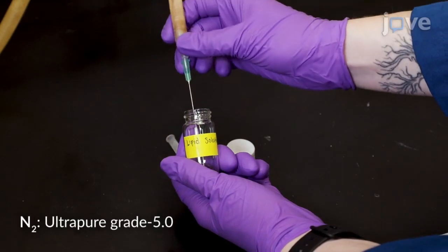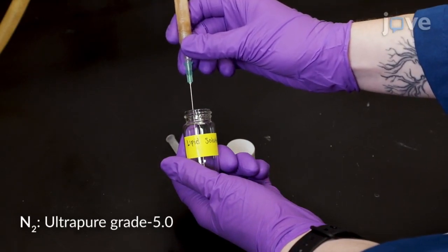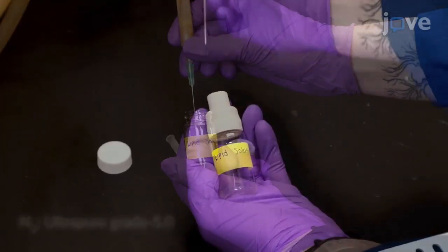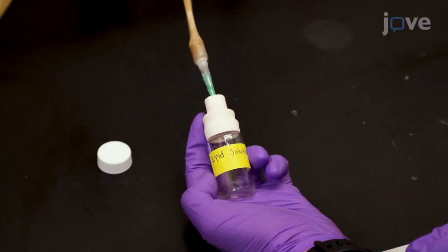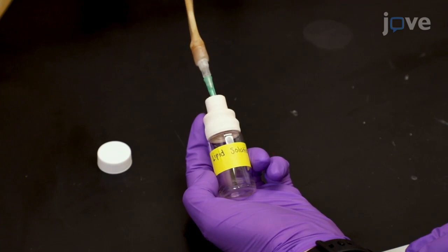Remove chloroform from lipid solution using a stream of nitrogen gas. To ensure full removal of chloroform, connect the dried lipid film to the vacuum for at least four hours.